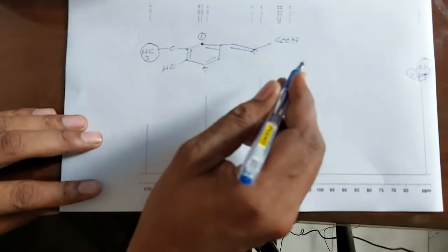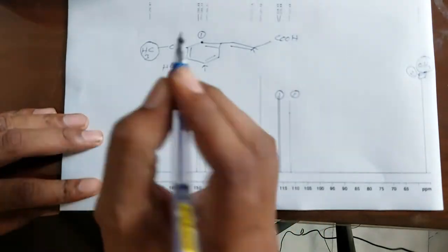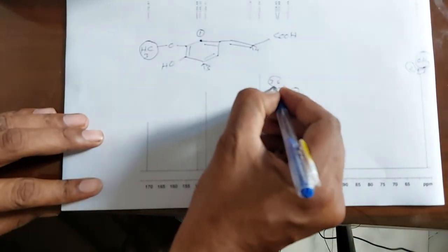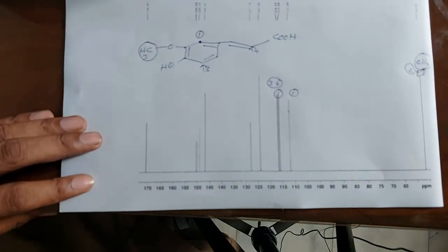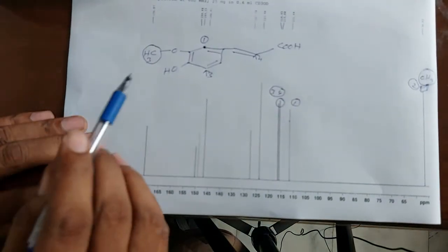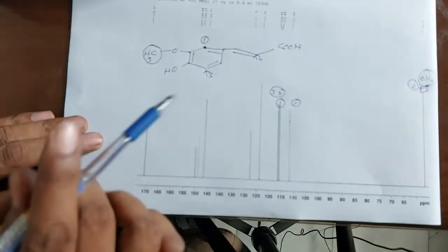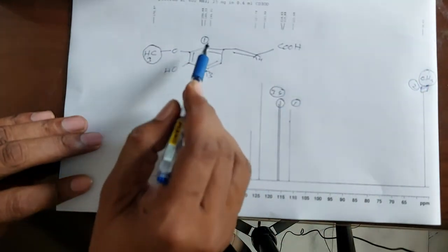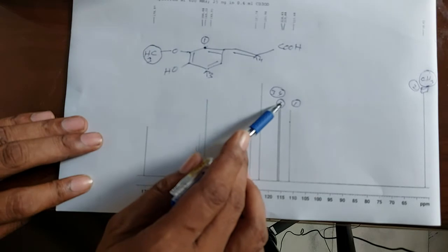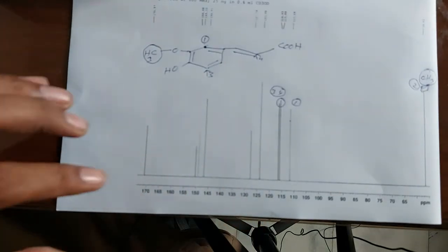The number of carbons can only be identified by using carbon-13 NMR. You see here these two peaks of these two carbons, this is 3, this is 4, and this is 3 and 4. These two peaks are appearing over here. And now we have justified that one is methyl, which is present over here, and these are two carbons. This carbon is 1, the first peak, which is very close, and next there are two carbons and two peaks appearing over here.